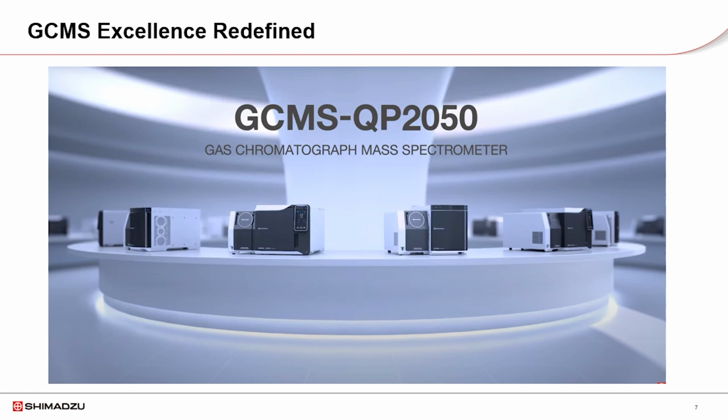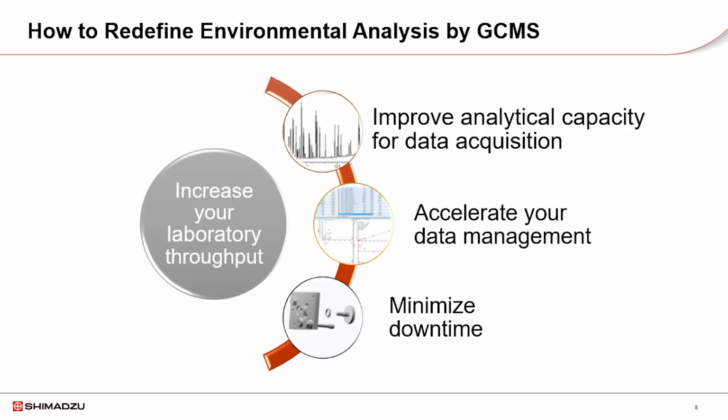So Ruth, what are the main roadblocks environmental labs face when doing a GCMS analysis? In general, every type of environmental lab is going to look at improving the lab throughput. Constraints might be different, or priorities. Big commercial labs may have the need of reporting results as fast as possible to the clients.